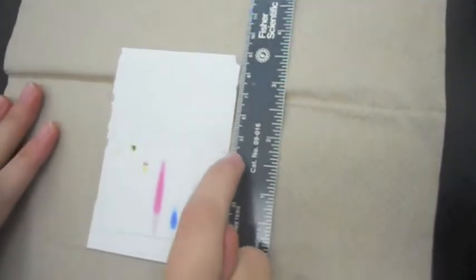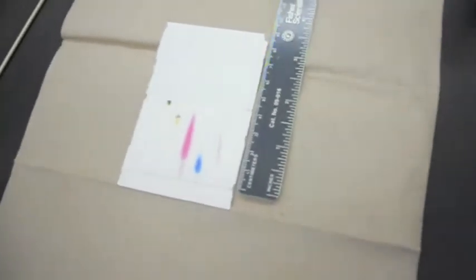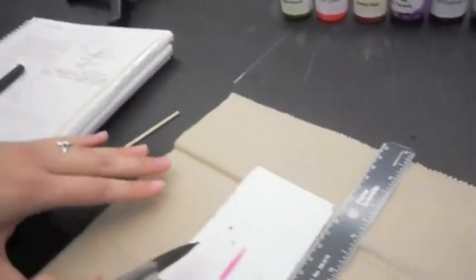So at this point, it was 4.3 centimeters. So we're going to write down the distance of the solvent was 4.3 centimeters. Then for each ink component, we have 1, 2, 3, 4, 5, and the unknown. We're going to measure to the middle of the ink. So this one we had 1, 1.